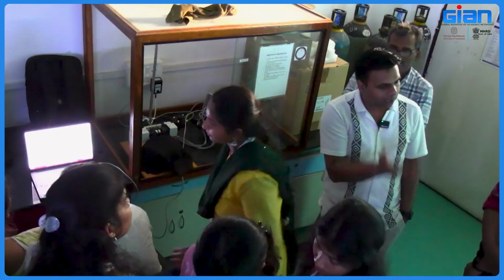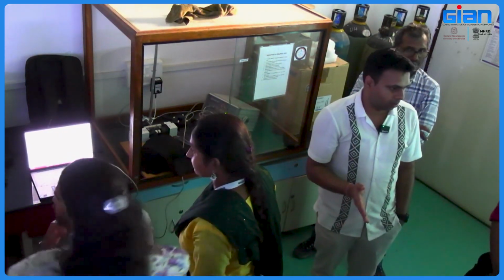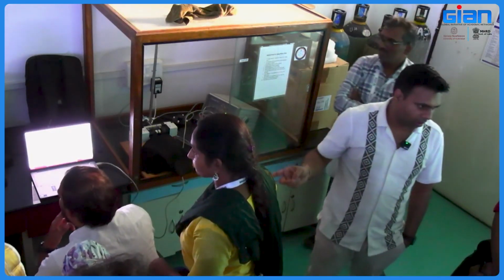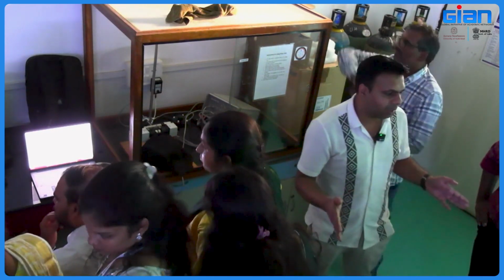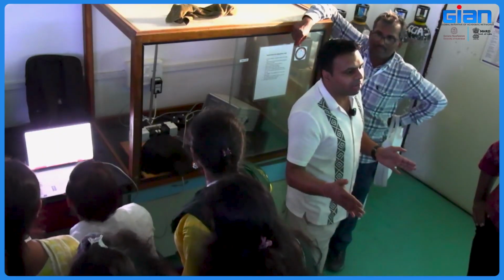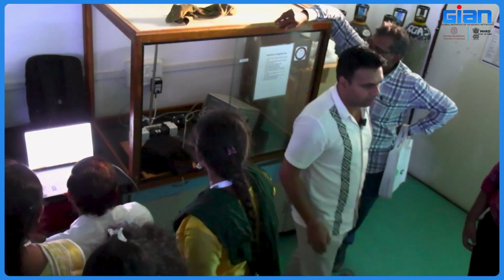If you want an SMT curve, the same program has to be run for 5 minutes. You can't do that here; this is basically a more detailed version. SMT can be done in HandyPEA, you just have to extend the time frame from 1 second to 5 minutes. So you can get slow fluorescence and the plateau phase also.